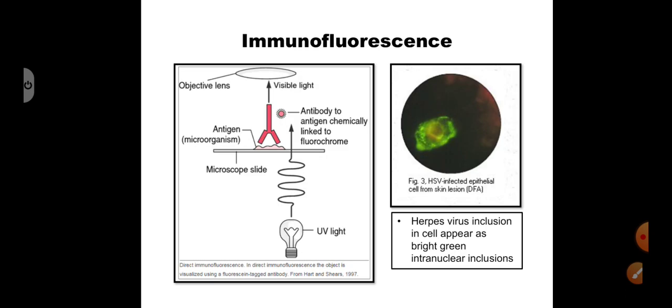For those who are interested to know what immunofluorescence is: usually for fluorescent microscopy, to the specimen on the slide, you use a fluorescent dye to stain. But here, instead of using fluorescent dye directly, the specimen is an antigen, with a variety of antigens. So externally, what you prepare is an antibody against this antigen, which is tagged with a fluorescent dye.